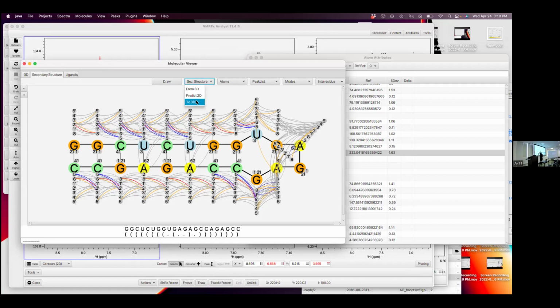So we insert artificial linkers that go over here and then go back, and now this helix can be predefined. We can just say, set the structure of that as a helix. That won't work because this tree can't have a closed cycle, so we introduce a break here and then put in constraints that pull it back together. And so now we can predefine the helix, and we can predefine the tetraloop and allow angles where they connect to float.